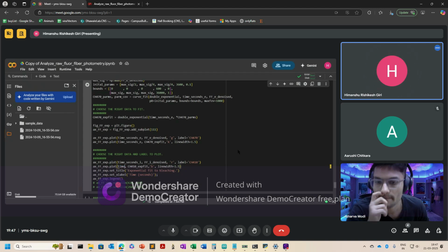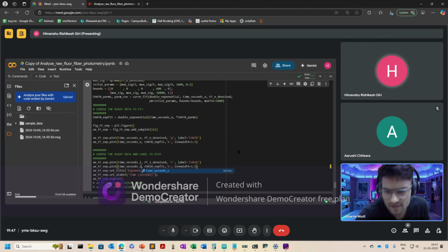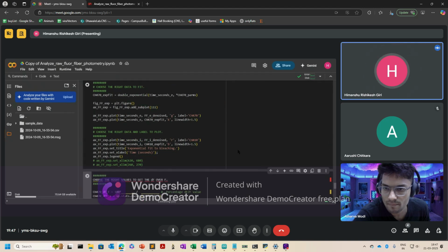It doesn't matter that much, but this fitting takes a little time.